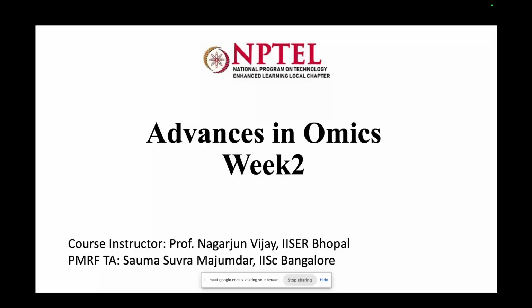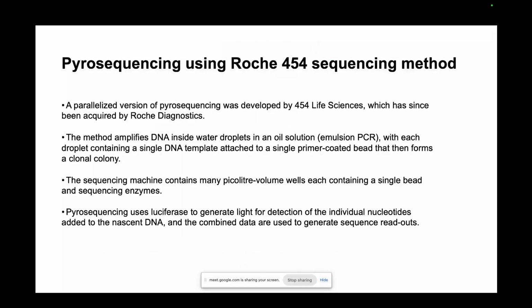So after I complete the topics for this week, I am going to briefly talk through the different kinds of algorithms and techniques that are used for data analysis for genomic data, right? Okay, so we have a good amount of things to discuss today, so let's get started. As I was saying, we'll start with the pyrosequencing module.